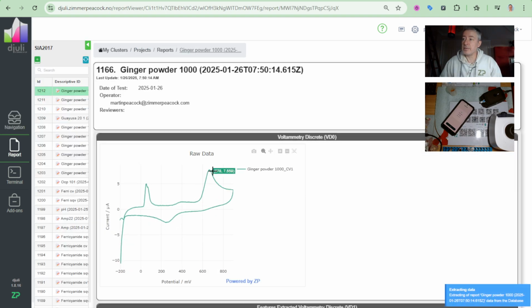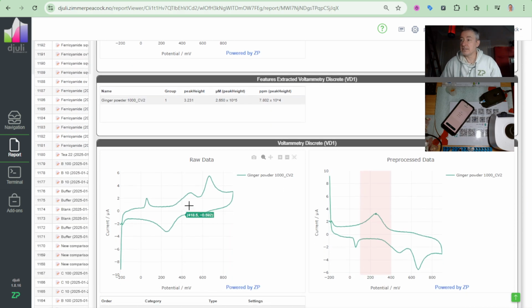And then I can see that that peak has not been cut off because it was so intense. And I can see again that peak's not cut off, and then I can see the analysis here, and that looks really quite nice. What I mean by nice is the quality control I'm looking for is, can I see these peaks, 1, 2, and 3 here, and can I see that peak there? And that's big thumbs up.